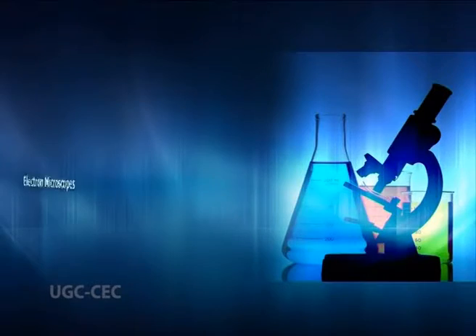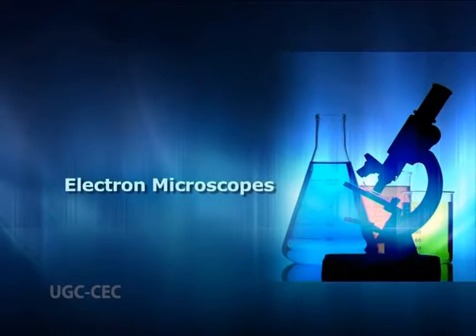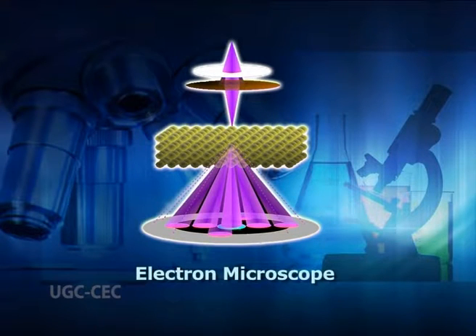As we know, on the basis of illuminating source, microscopes are mainly of two types, electron and light microscopes. Electron microscopes use electrons as a source of illumination. The electron microscope is one of the most advanced microscopes used today.